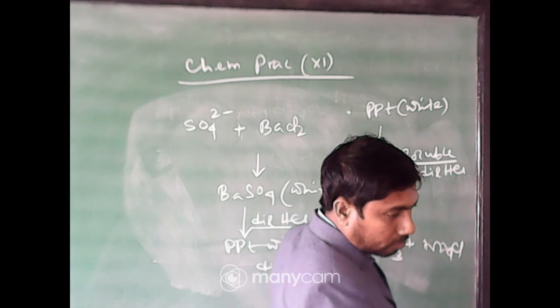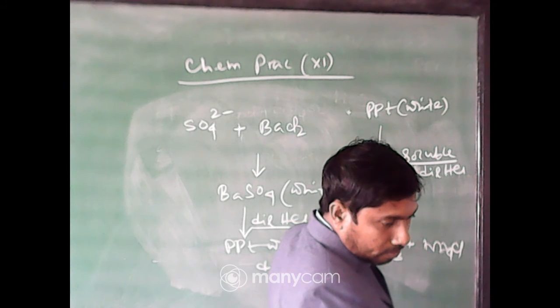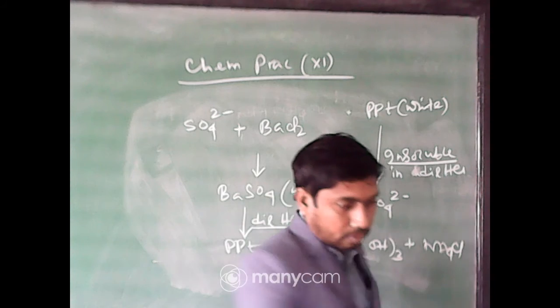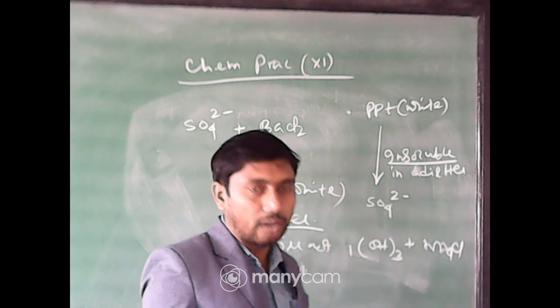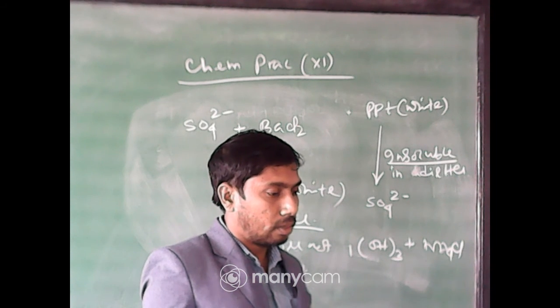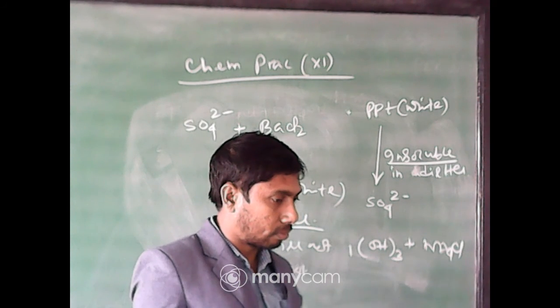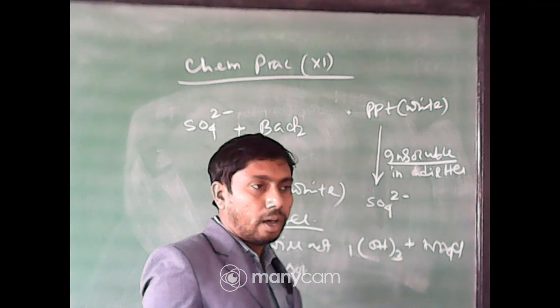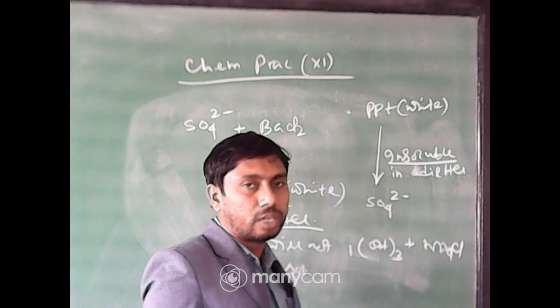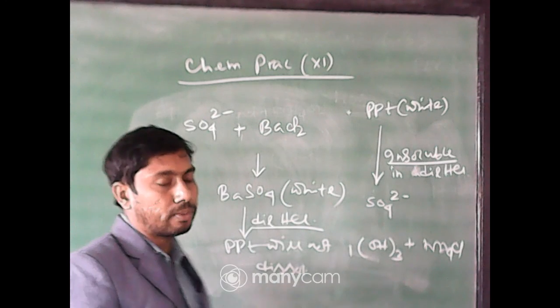Srijata. Now, any queries regarding those tests, that is the test for aluminium and the test for sulphate? Okay. You have to do that practical by your own hands in the laboratory. As we are telling the theoretical part, may it help you further for the lab work.